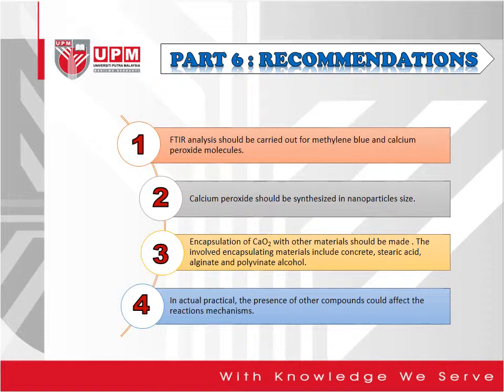This is because in some actual applications, the direct addition of calcium peroxide can raise the concentration of hydrogen peroxide to a very high level, which is not good. Lastly, in actual practice, the presence of other compounds could affect the reaction mechanism and the efficiency of the degradation process. Hence, extensive research on calcium peroxide should be investigated further to increase the degradation rate.